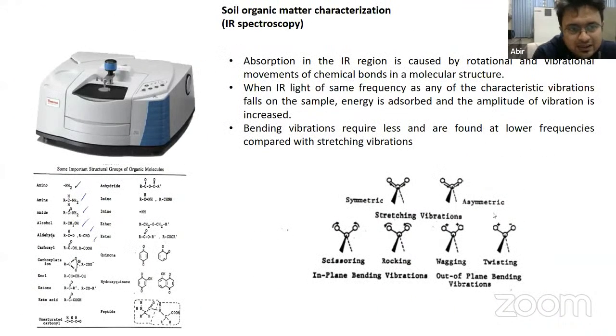Then we can have small information about how to characterize those organic matter. Now we have our very pure humic acid particles, which we have separated from our soil. Now this humic acid may have different amounts and different types of structural groups, maybe amino groups, amine groups, quinone groups, carboxylic groups, ester groups, ether groups. So that actually says a lot about the type of those humic acids.